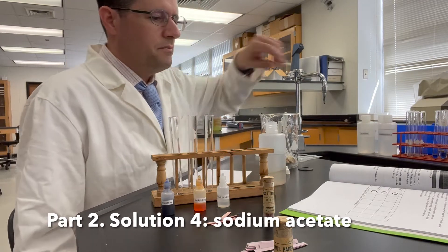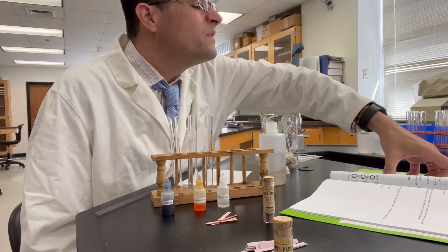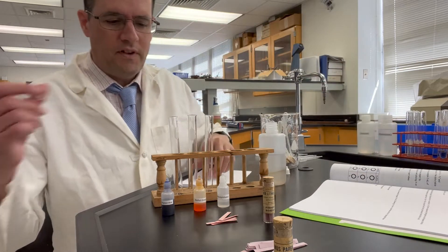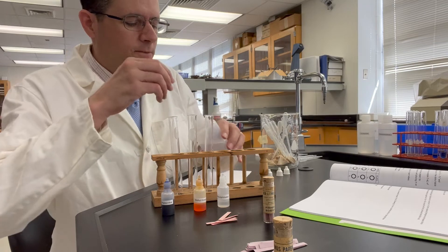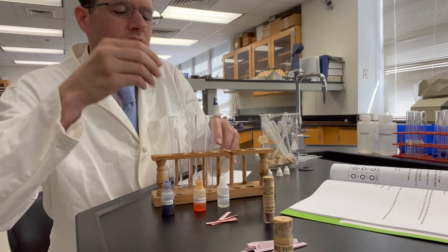Next up we are studying sodium acetate. Sodium acetate is solution 4, so we've got test tubes 4a, 4b, and 4c. Let's go ahead and add 2 milliliters of sodium acetate to each of these test tubes.